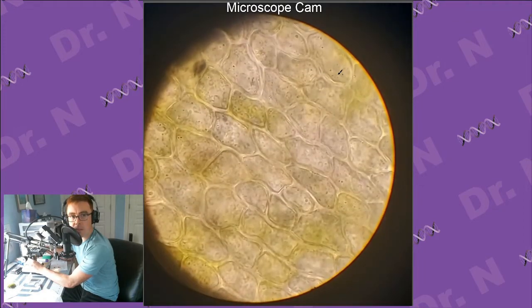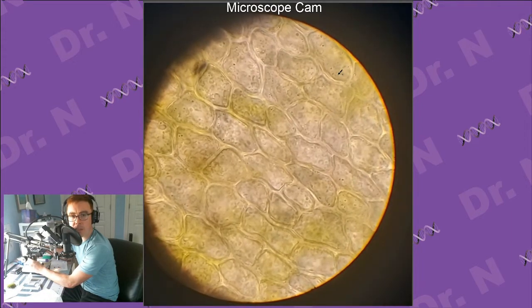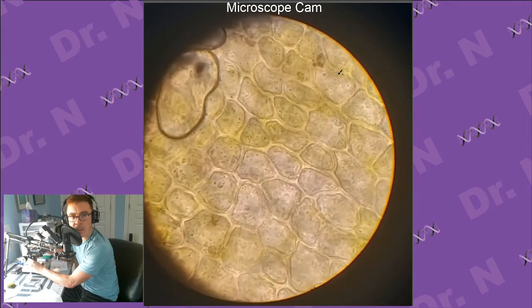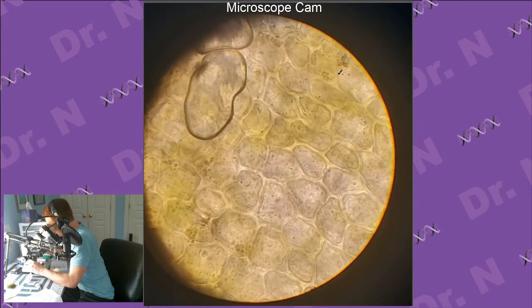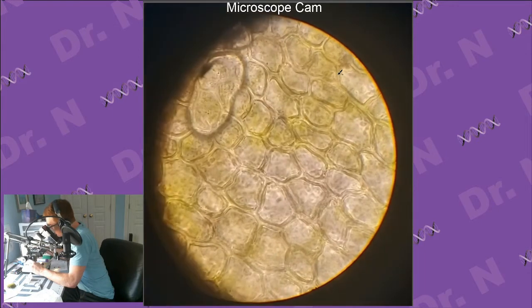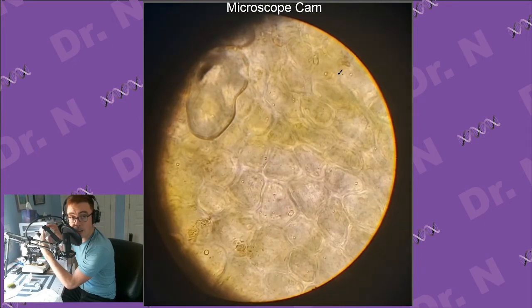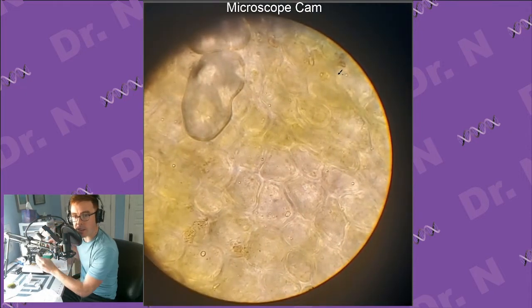We're looking at the outside of them, so it's clearly some kind of outer layer. What look like veins are probably the cell walls of the individual cells inside, and we can actually see pretty well inside of these, and there's some structure. I'm just going to look under the eyepiece really quick. Actually, I moved the camera. This time it looks a lot better on the camera, not the eyepiece. There's a lot of background that the camera's not picking up, which is nice.